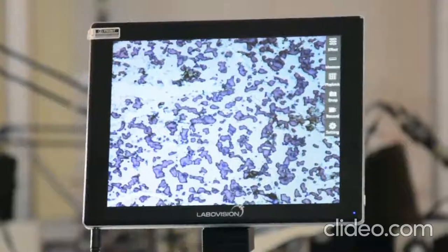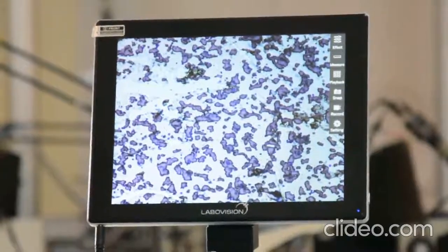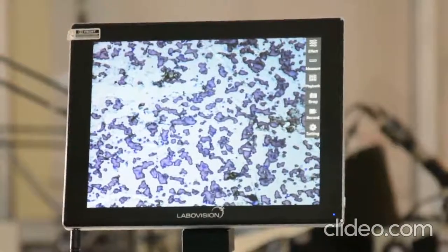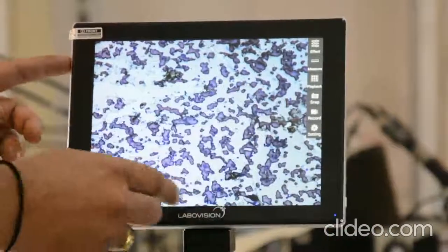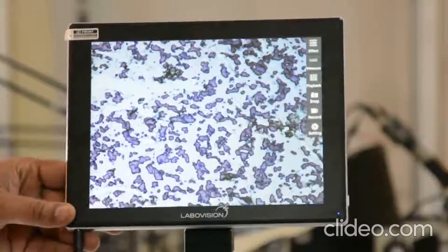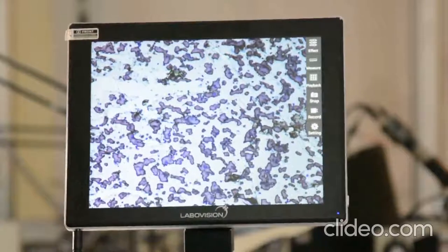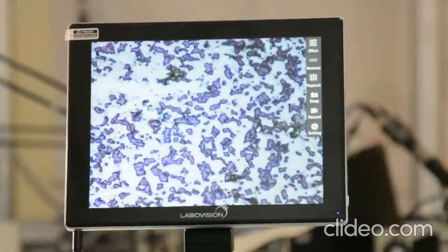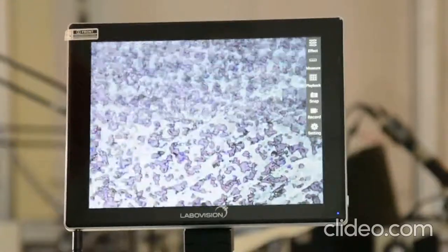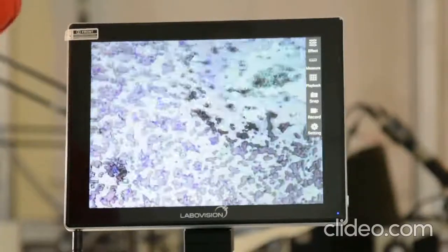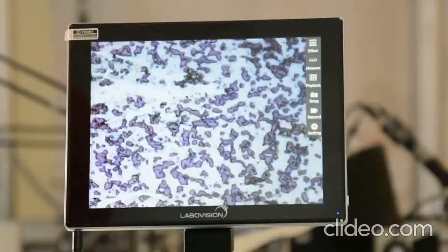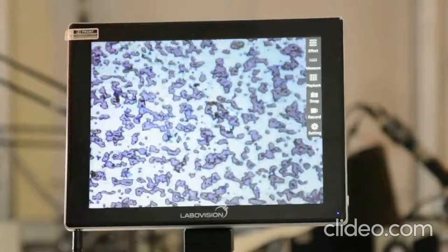Now we will slowly gradually take you through the functions of the LCD screen. It is a 9.1 inch tablet. It is more like an Android tablet. Now this is the live picture what you are seeing from the slide. This is basically on 40x. As you can see, we are making a move on the slide.